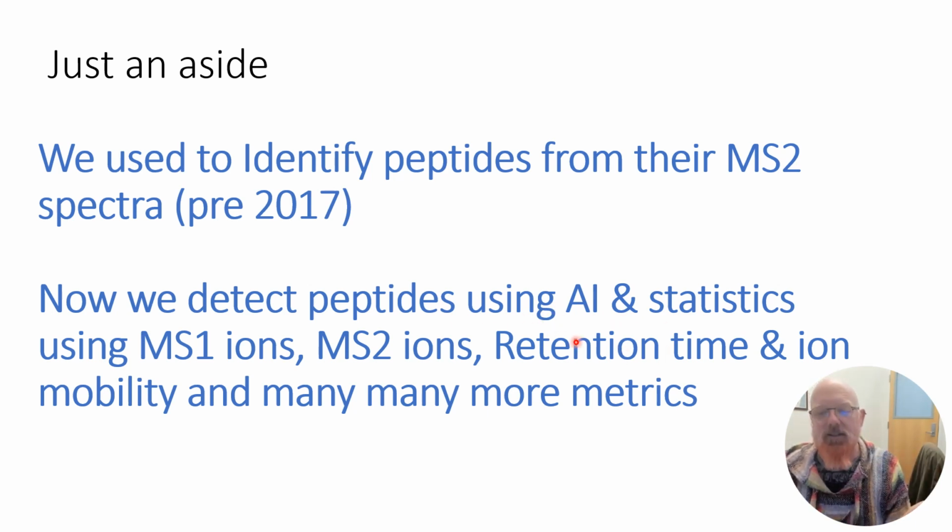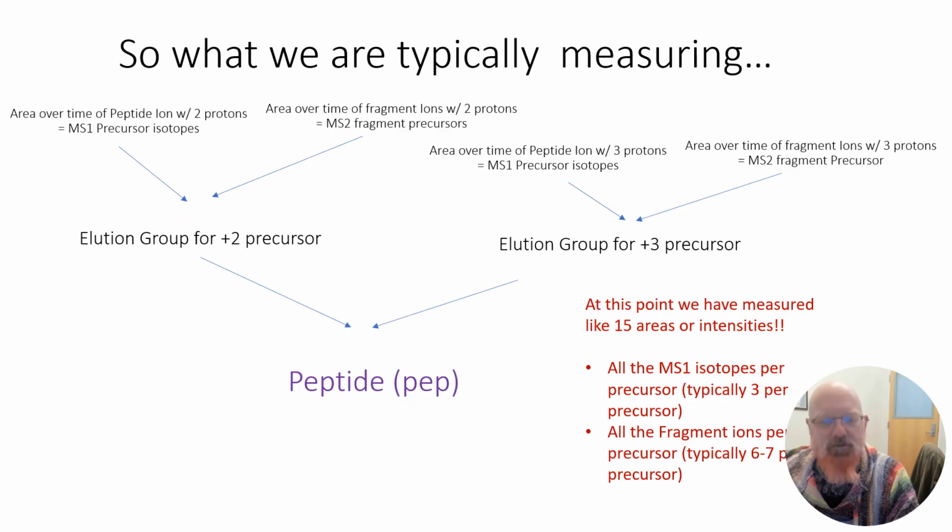But basically, they're either deep learning or traditional machine learning technologies that can figure out physiochemical characteristics of these peptides, like what their masses are, which is easy, but what are the intensities of the fragments? What are the retention times? What's the collisional cross section or ion mobility, for example? And using all of these things, we can now detect them much easier than we could have before.